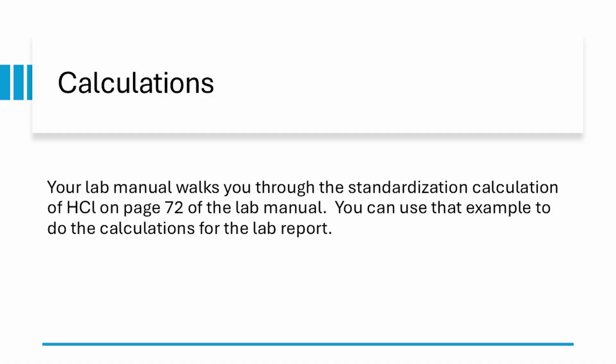Now, the calculations are discussed in the lab manual. There is a really nice stoichiometric setup done for this lab with some sample data. Please make sure that you're following that sample data when you're using your values so that you can get your best calculation results.